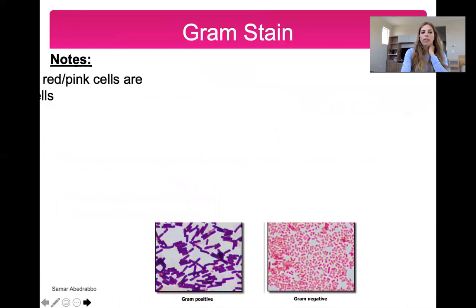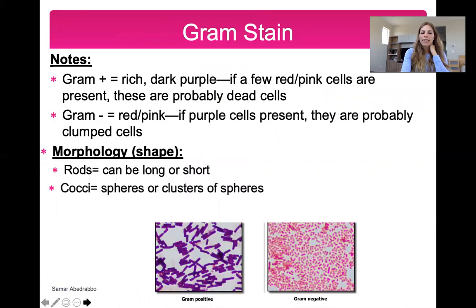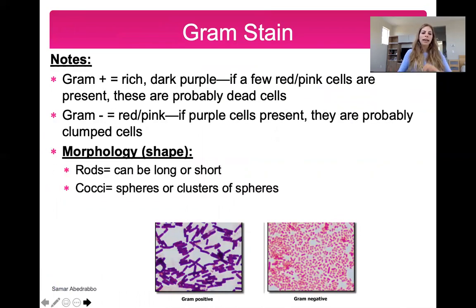And I have a few images, a few notes, because it's really easy to tell students that purple is gram-positive and red is gram-negative.